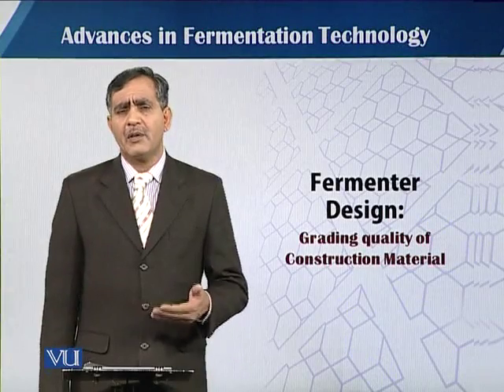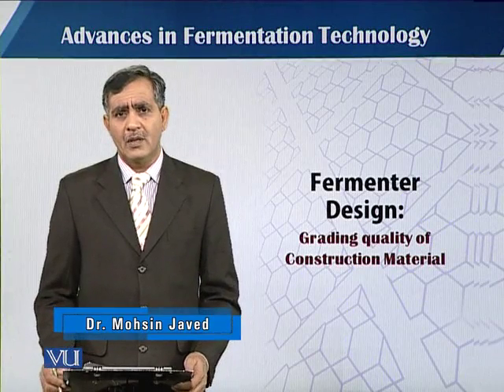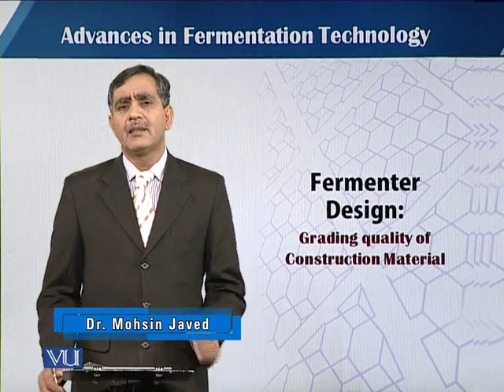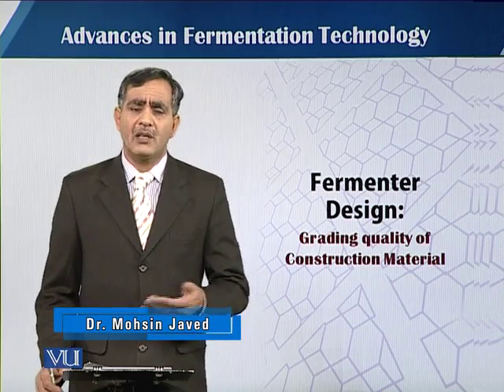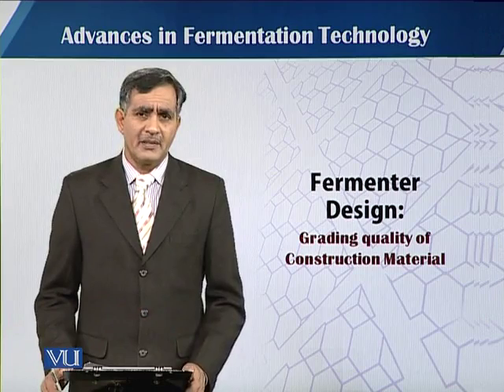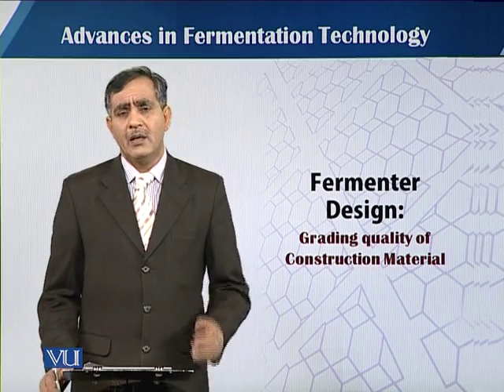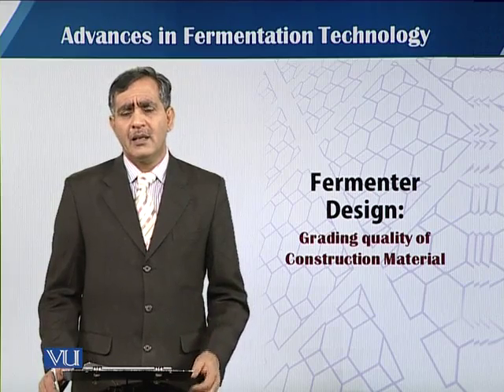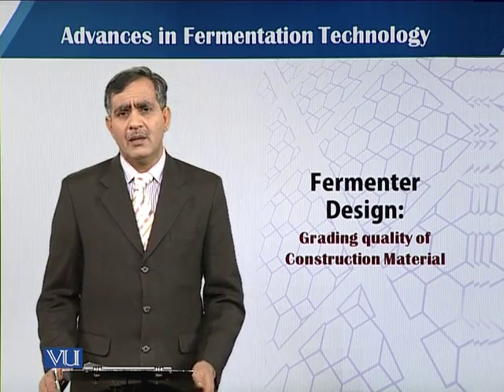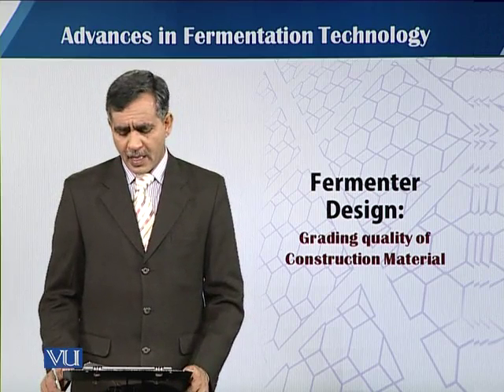As we have seen in our previous module, stainless steel is our choice for the construction of industrial scale and pilot scale fermenters due to its properties like being non-corrosive, resistant to acids, resistant to seawater, and having other engineering properties.